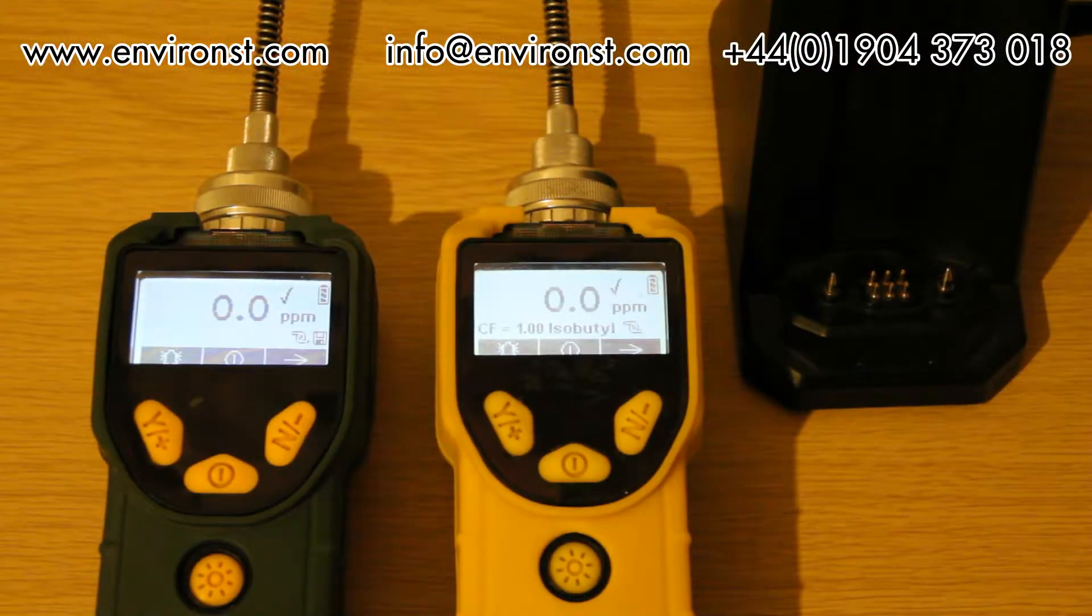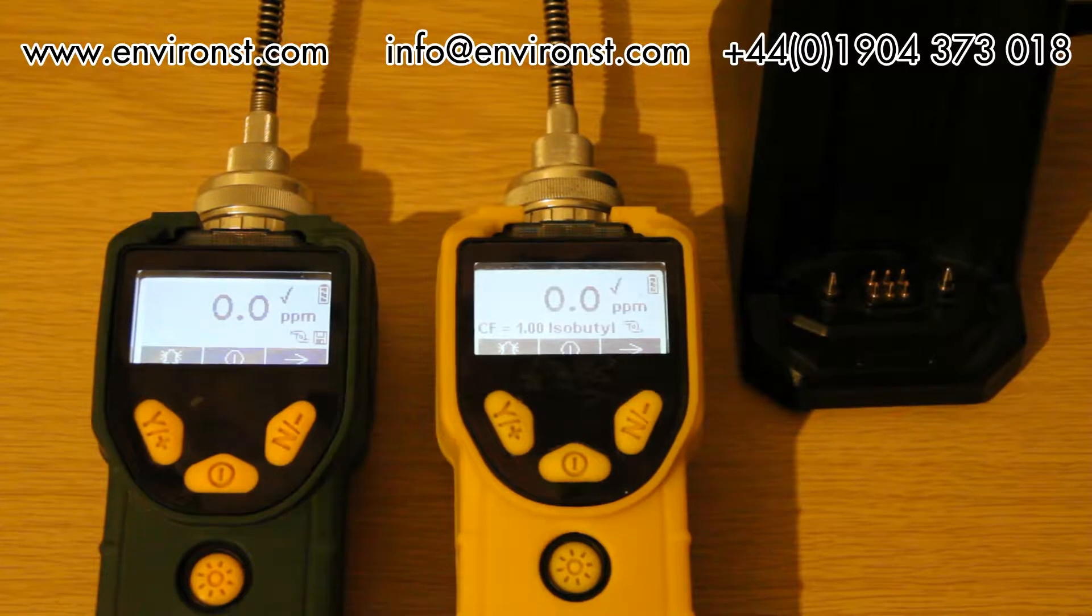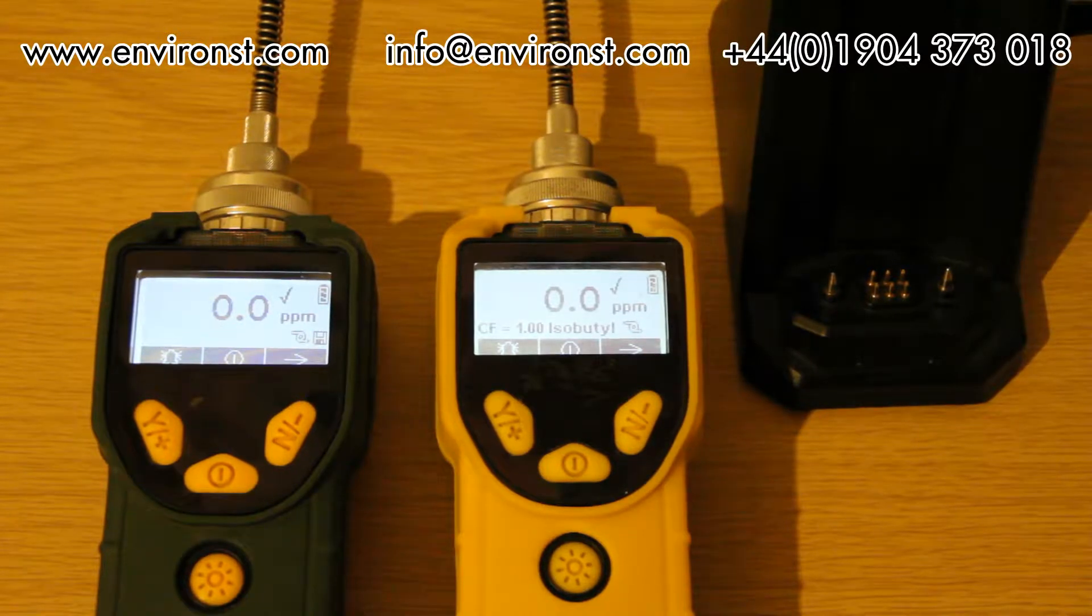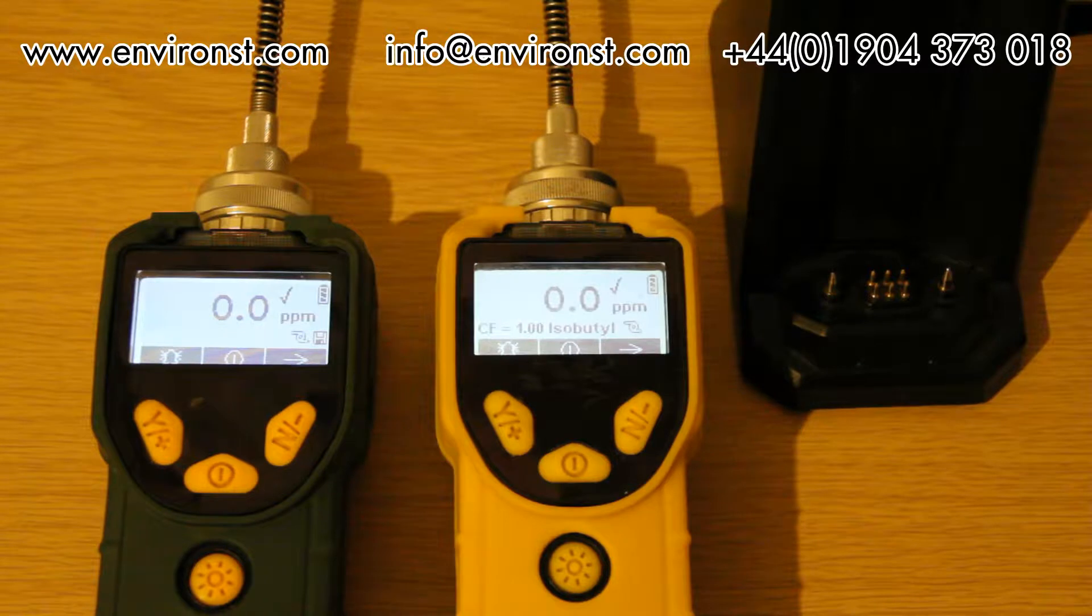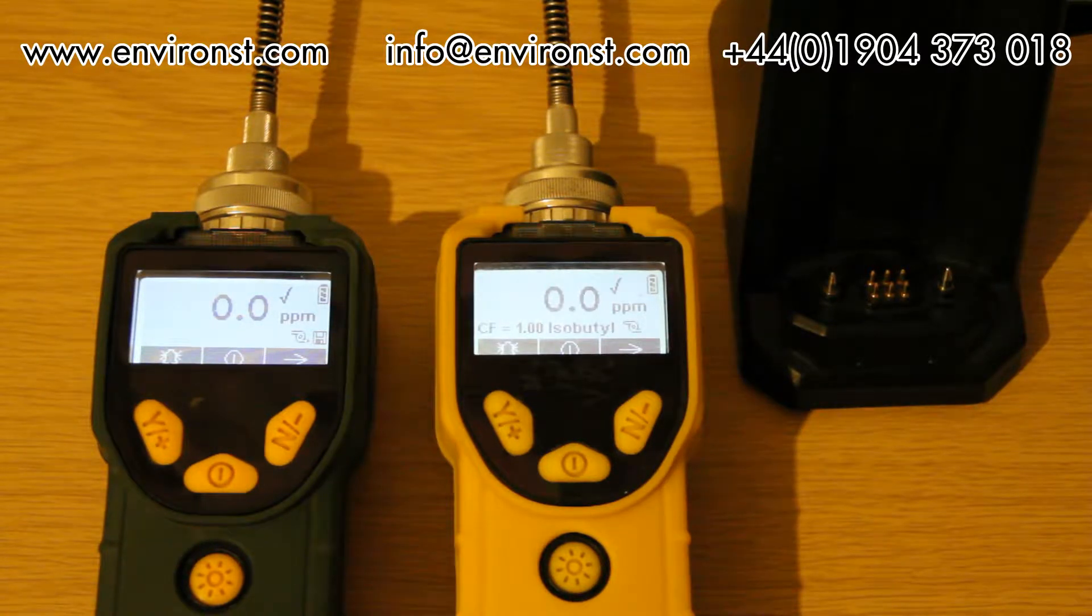Hello and welcome to Environmental Science and Technology. I'm Dr. Steve Goodman and today we're going to take a very brief look at how to download your mini-ray light and your mini-ray 3000 data logging.